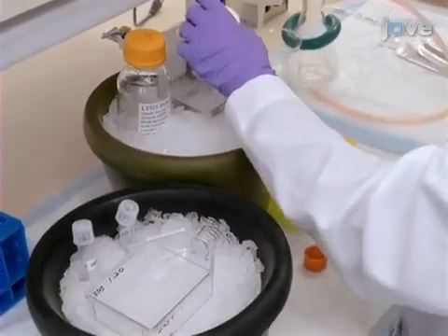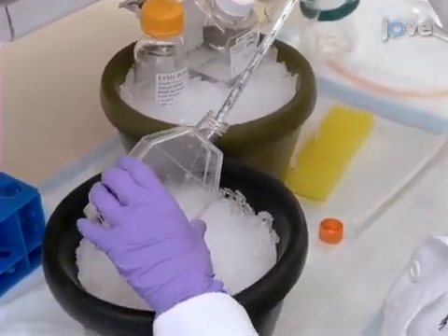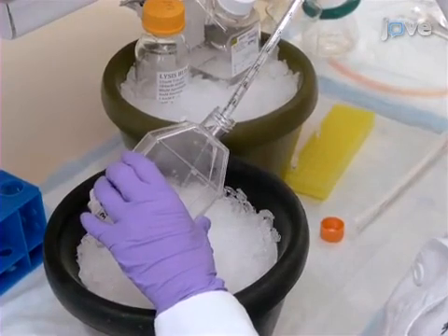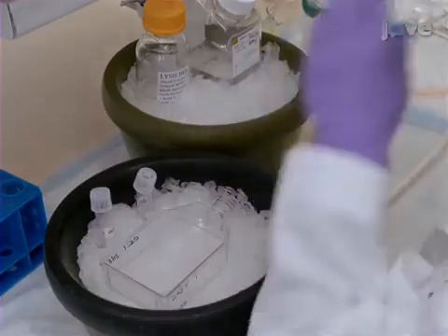To begin, wash the cells briefly with ice-cold phosphate-buffered saline, or PBS, using 10 milliliters of buffer per T75 flask. Keep the cells on ice for 5 minutes or until they start detaching from the flask.